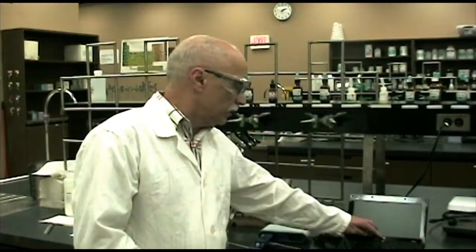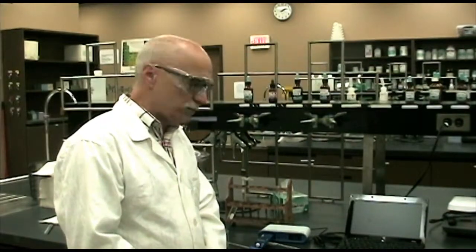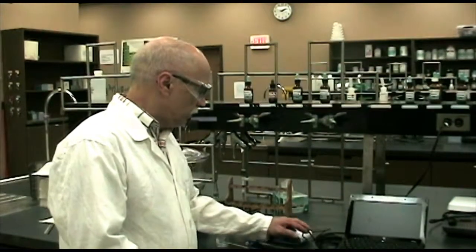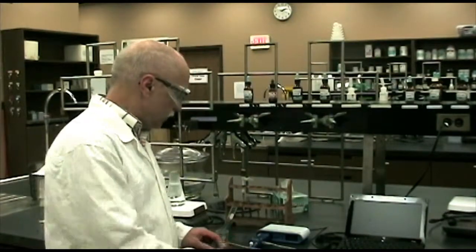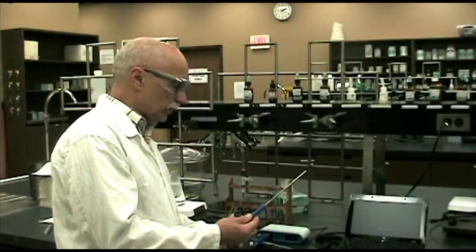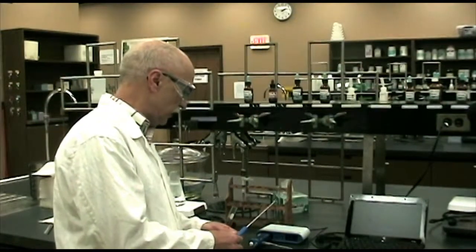As you recall, we turn on the computer first, and we make sure that it's booted up and running before we connect the Pasco unit with the USB. As you can see, here is the Pasco unit with the thermometer, different than the equipment that you used in 110 for the gas law.